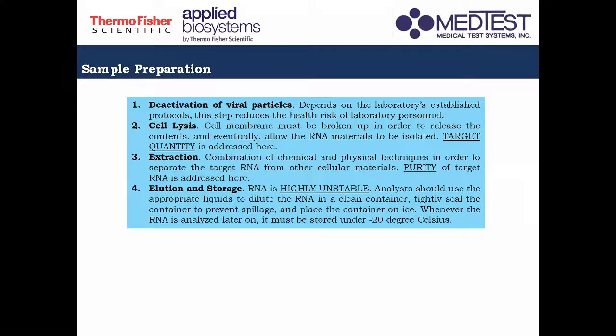So in the case of COVID workflow, we want to get the RNA that is inside the cells.